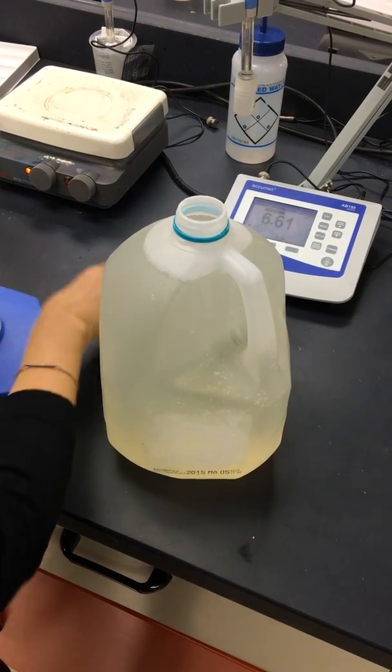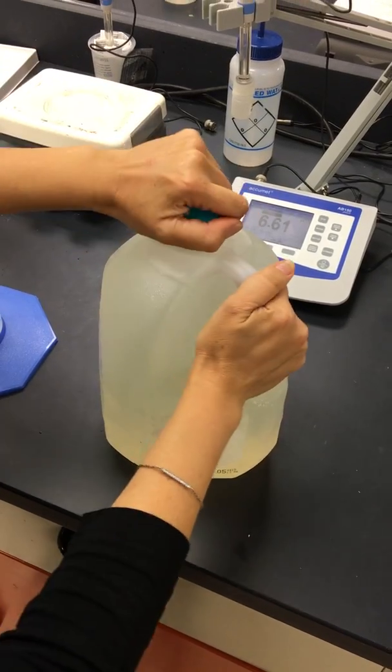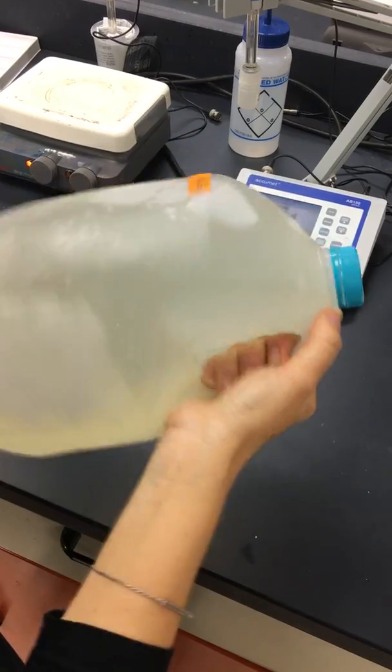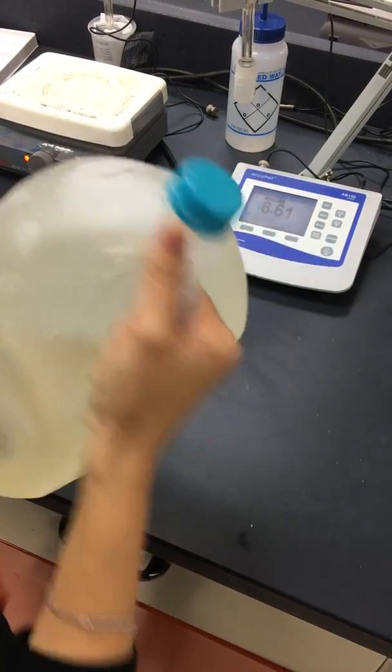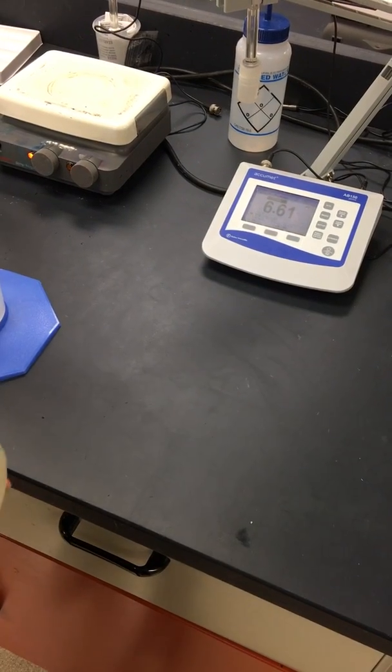This is going to be on the app — training videos. Okay, there we go. Now you can just give it a good shake, and then you can store it in the fridge and it'll be ready to use.